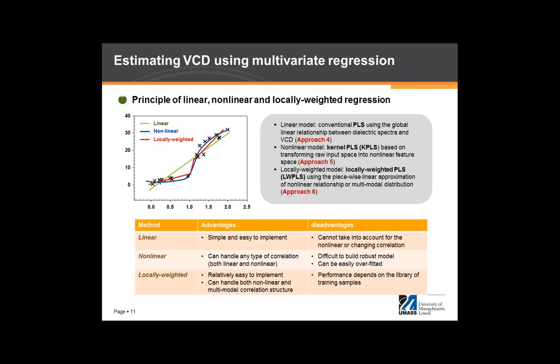However, in this case, the partial least square model is going to be built based on a piece of the data set, but your data set is being updated. For example, in the first few days your regression is based on the data set up to day 3, and then on day 4 you make the regression model based on the day 1, 2, 3 data set.